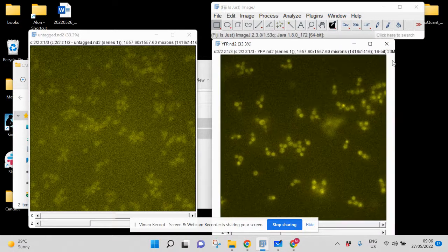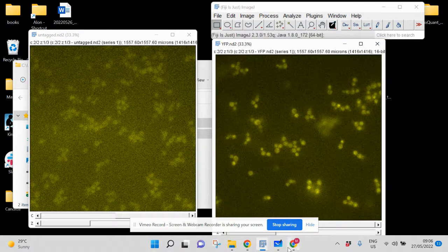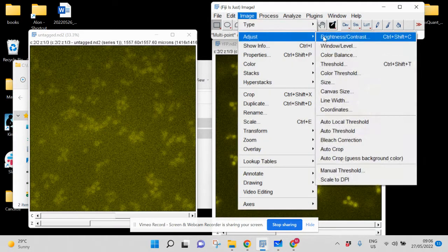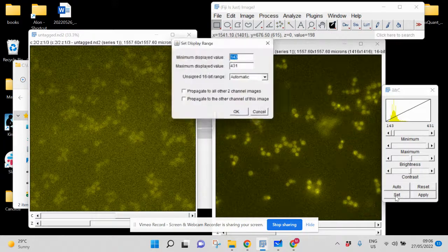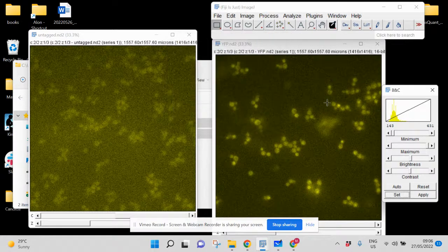To understand what's happening, we can look at Adjust Brightness/Contrast. If we go into the settings, we see that it's currently using automatic mode.